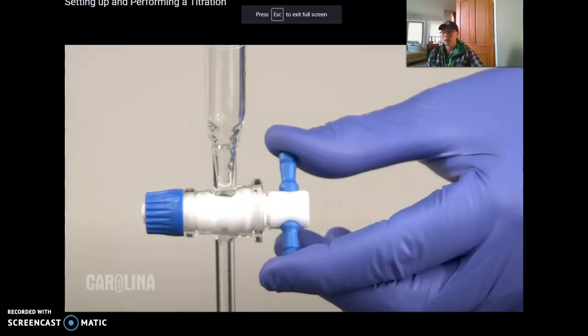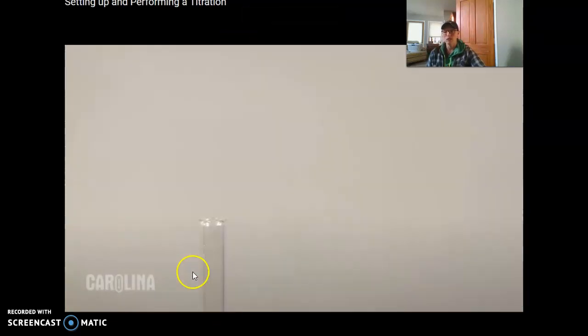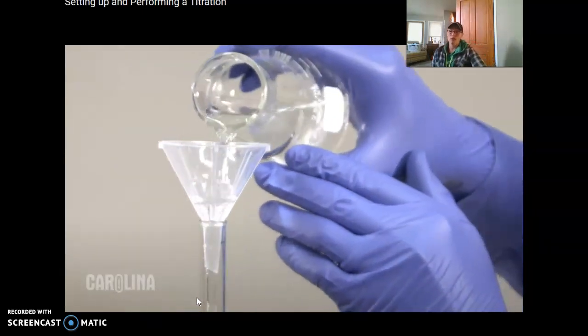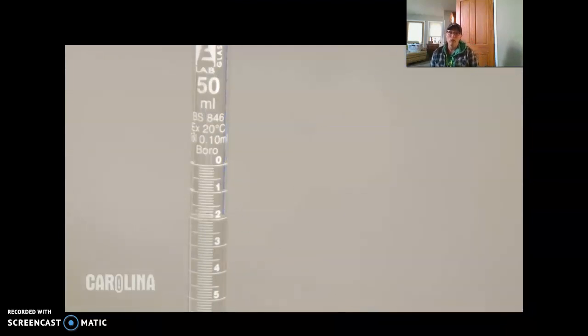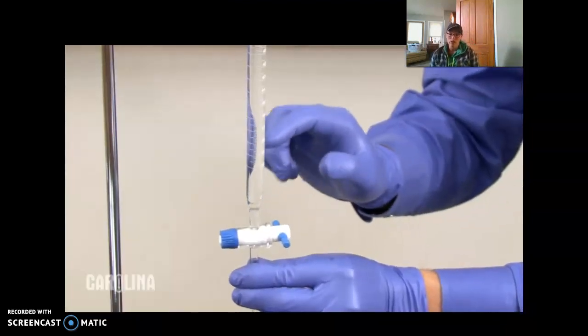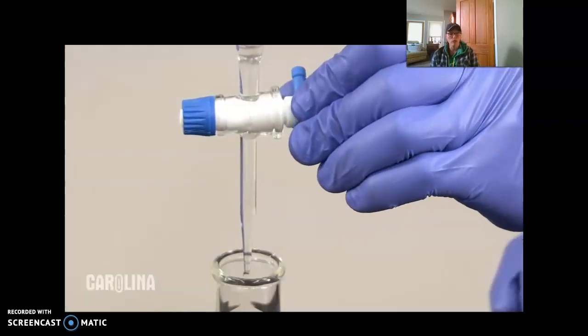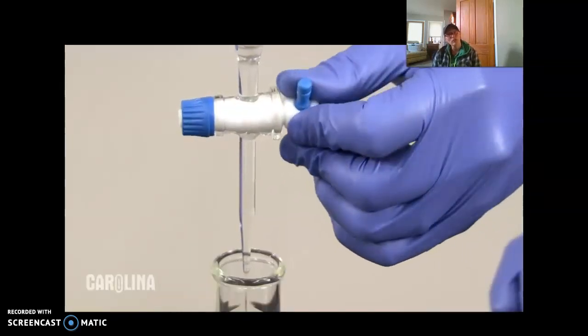The way this works is this is a pipette. We've worked with pipettes in the past, so you know what that looks like. Or burette, excuse me. I used the wrong word. A burette. And so it's a very particular amount of volume that it delivers. So the person is tapping on it right now to get air bubbles out. You're very careful that you put your unknown in. You know exactly how much you start at.